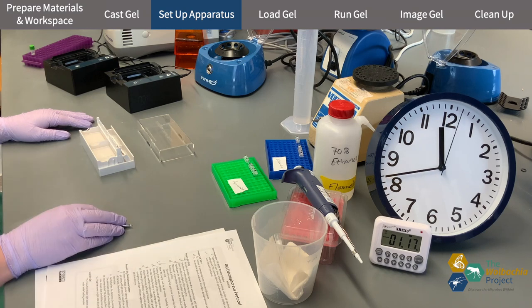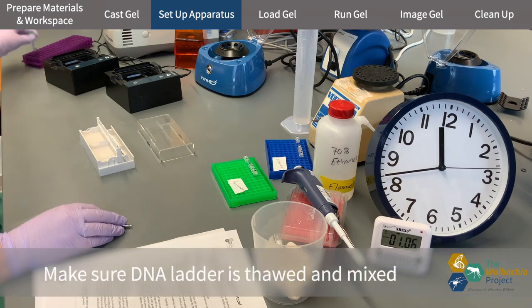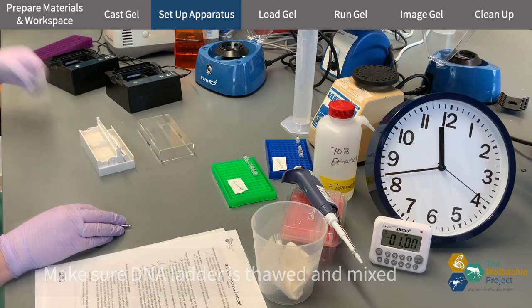While you're waiting for your gel to set, you can make sure you have everything else you need including making sure your DNA ladder is thawed and mixed.